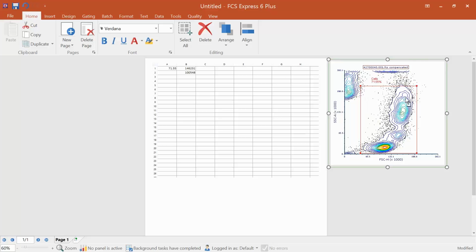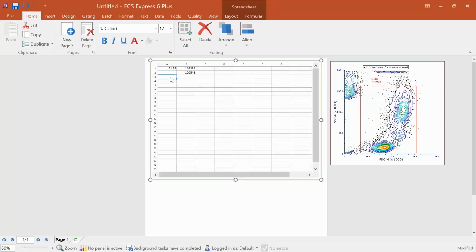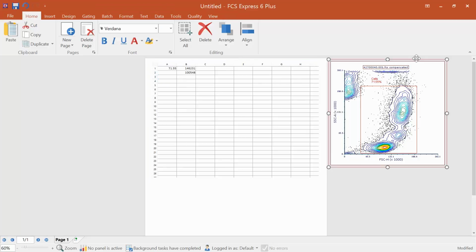Now, additionally, you're not limited to just statistics because, as you know, spreadsheets can handle text information as well. If I just enter text, it will handle that, and there's a number of useful things about having text in spreadsheets.